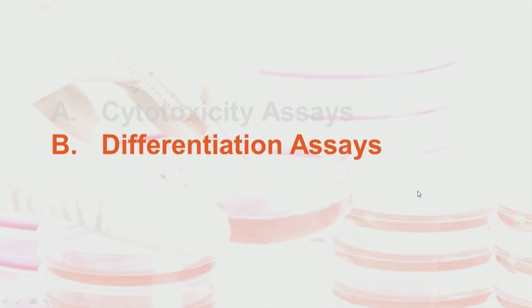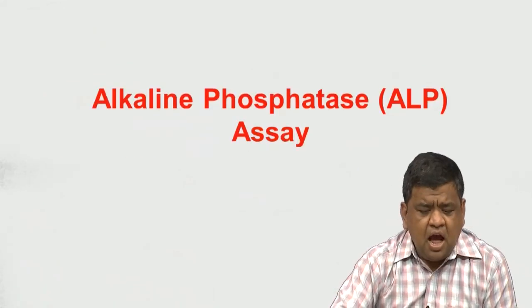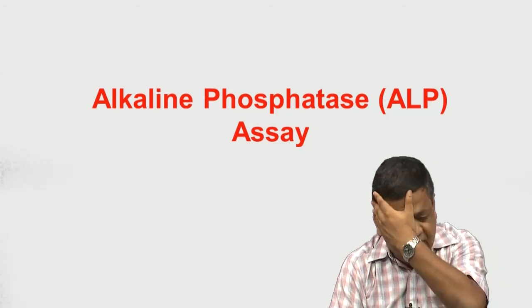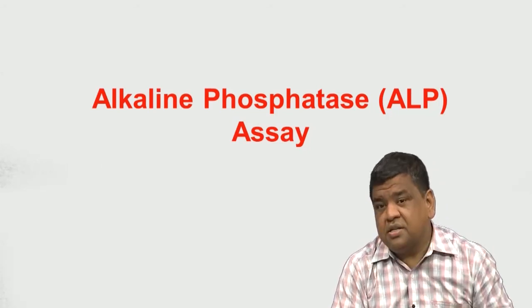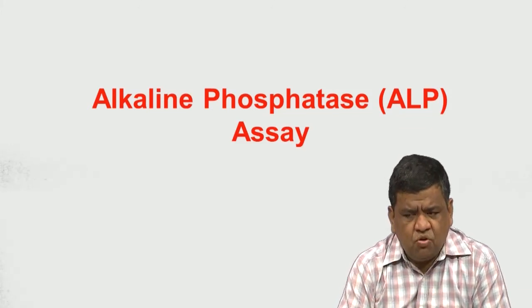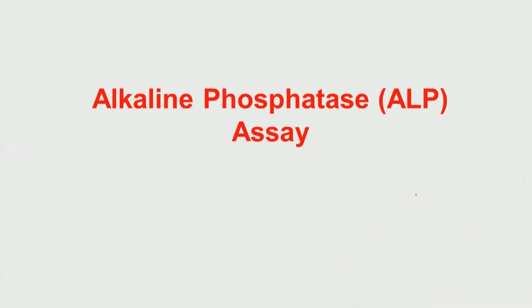Now, coming to the differentiation assays. Differentiation means the differential gene expression, which I have mentioned earlier. In the context of bone tissue engineering applications or orthopedic applications, which is the theme of this course, there are two assays which are important. One is the alkaline phosphatase assay.